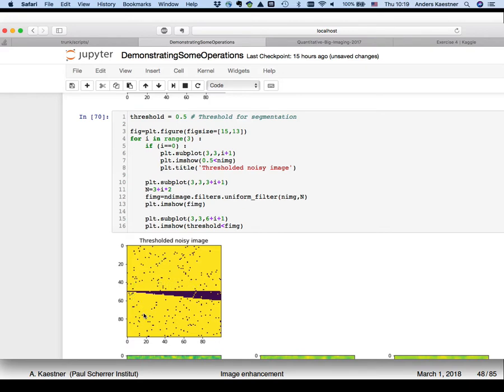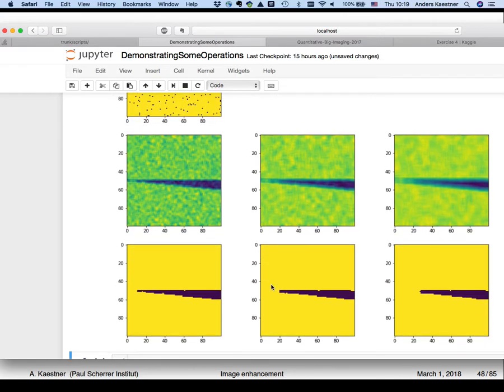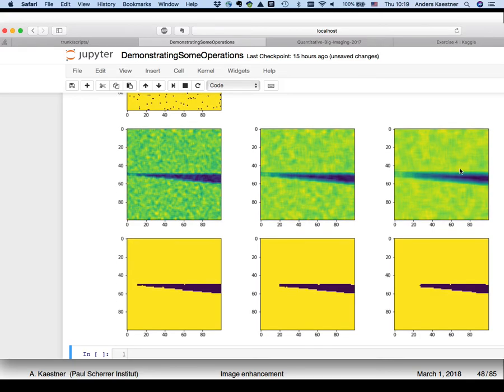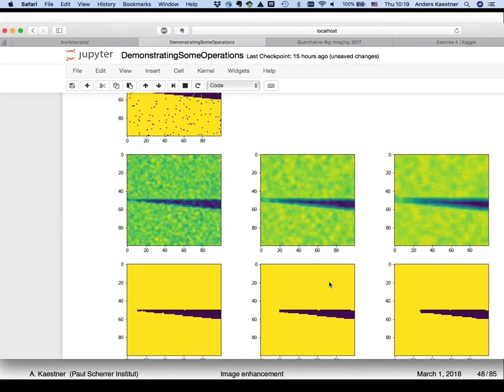Well, the gap is still there, but you have a lot of misguiding information. So then we apply the filter. You can see the effect of the filter is that you smooth out all the noise, and here it's pretty well smooth. But still, you have the problem with the bridge here, that it bridges, well, a few misclassified pixels you get, but not as much as up here.